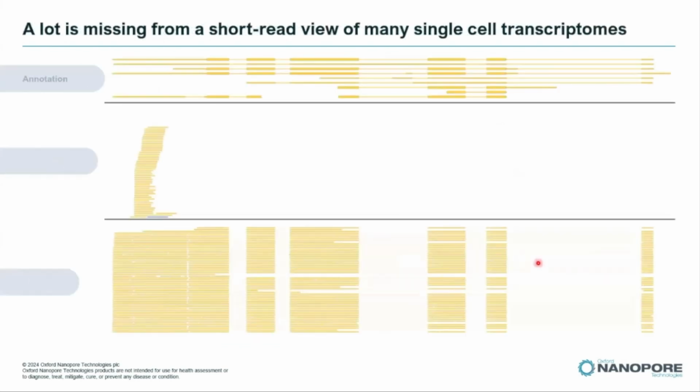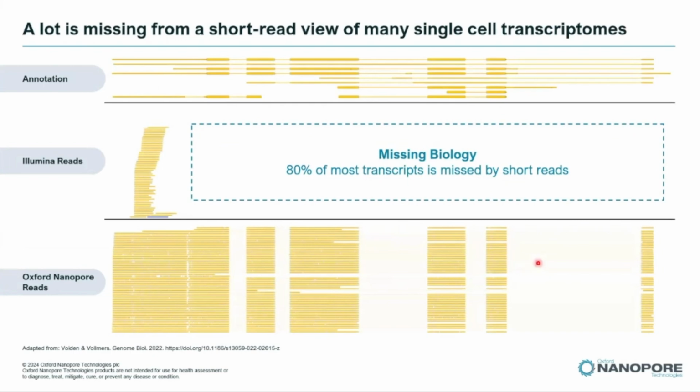But now, most of the popular approaches to look at single cell at high scale capture the molecules through their 3' or their 5' end, which means that when you apply short reads, as you see on this picture, you're going to sequence the 3' or the 5' of the transcripts. But you're going to miss all the information that we see here on this example, where we have a gene that is very complex with different exons and different transcripts. We cannot find this with short reads. This is where nanopore reads make a difference.